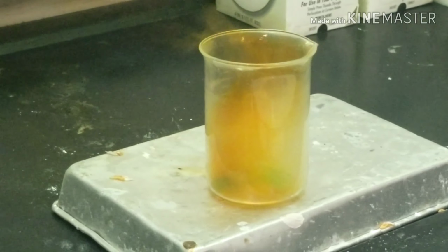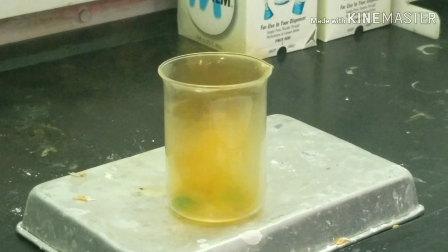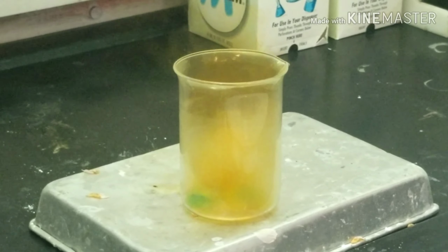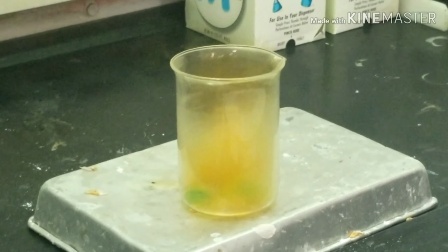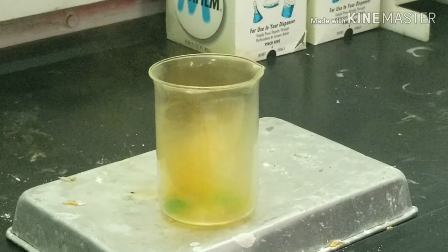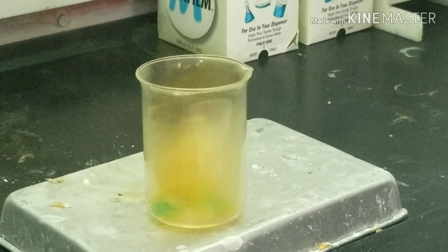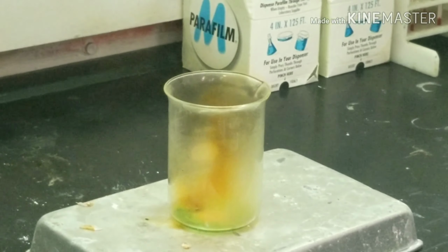Interesting, this was a penny that's new enough to where just the outside is covered with copper and also a zinc inside as well. So the reaction is slowing down a little bit. We're getting a little bit less nitrogen dioxide. Starting to see maybe a little bit of blue color in there.